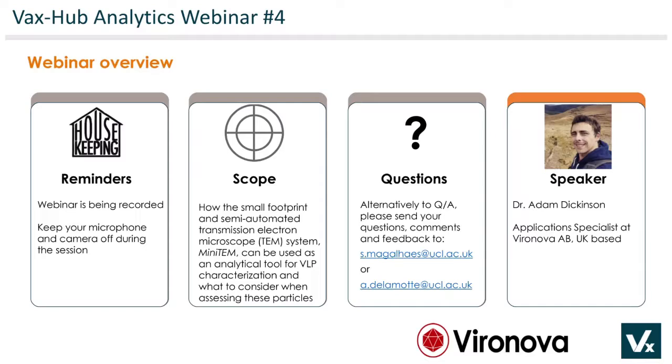The scope of the webinar will be to show the importance of using a MiniTEM system as an analytical tool and to assess the criteria for the image analysis of the particles that we will be using.